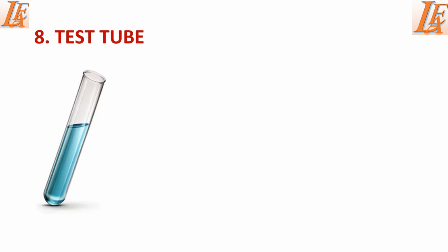Another apparatus that we have is a test tube, and a test tube is a small cylindrical glass tube with a round bottom and open at the top. So for you to identify a test tube, it should be small and cylindrical, and then it should have a round bottom, and then it should be open at the top. So that is the feature of a test tube.